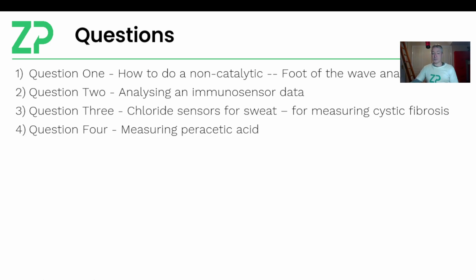Somebody else is interested in measuring peracetic acid. It's probably worth saying that on the ZP website, just recently, I have been doing some tests on milk, and I'll do some peracetic acid testing this morning.